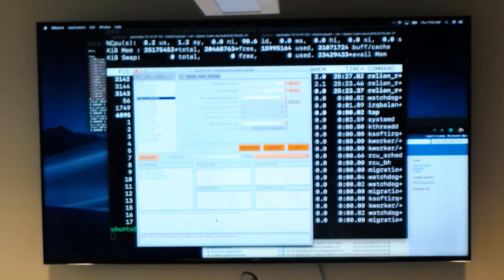In CryoSPARC it'll have a criterion to give you what it thinks is an ideal number of classes. If you specify more than needed, it'll say some of these are similar, so you need fewer. You could always specify more, but you don't have to. It's a matter of efficiency: the more classes and the more particles you have, the slower the processing will be, but you might not have a choice.